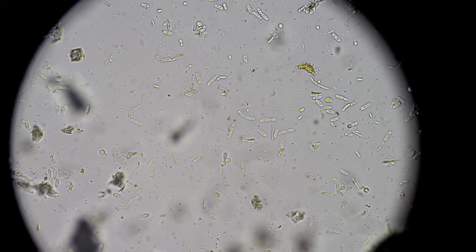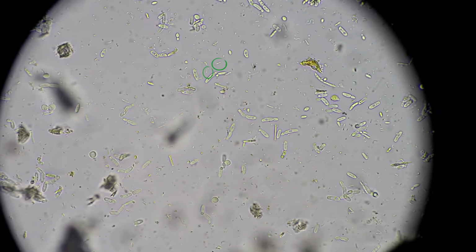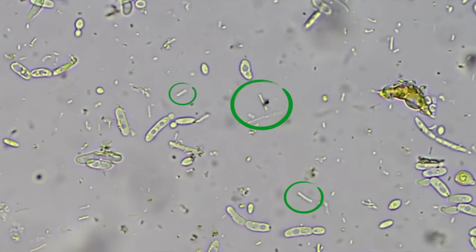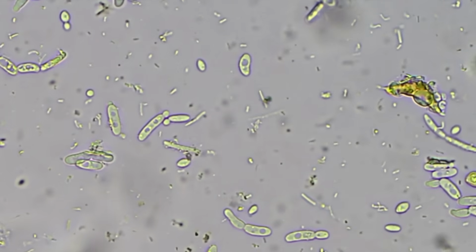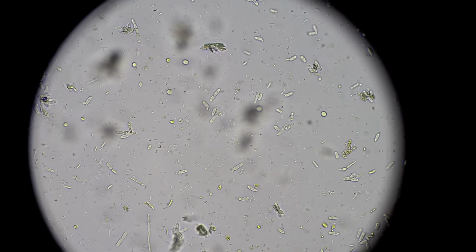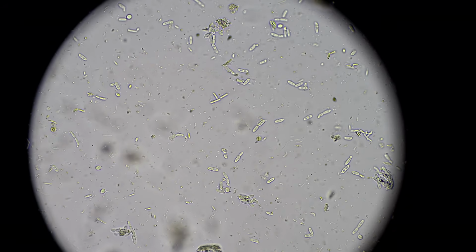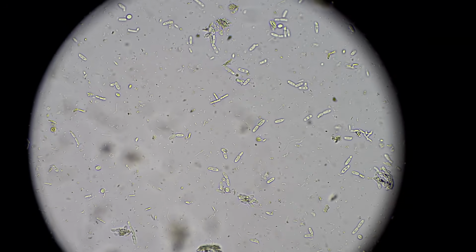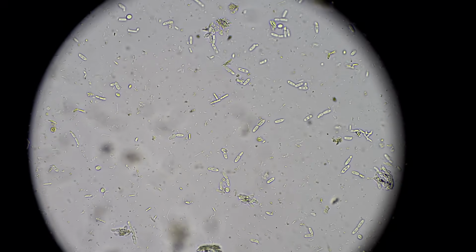So check this out. The small ones, like this fat rod right here, this rod right here, those are lactobacillus. Those are exactly who they're talking about. They're long, bacilli-shaped rods. And so they're all over the place. You can see them. These rods, this is lactobacillus. They are biocontrol. And we also see what looks like actinobacteria. And streptomyces is an endophyte, and it as well as candida are ingredients in EM.